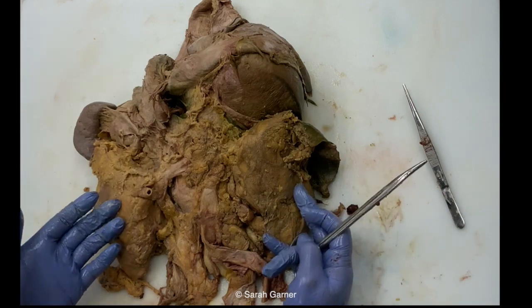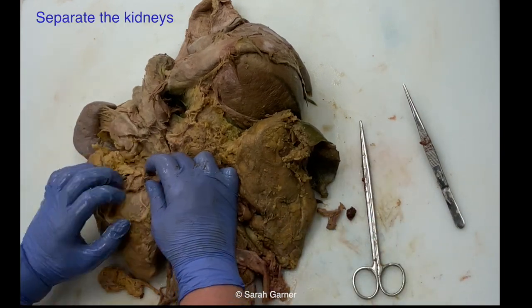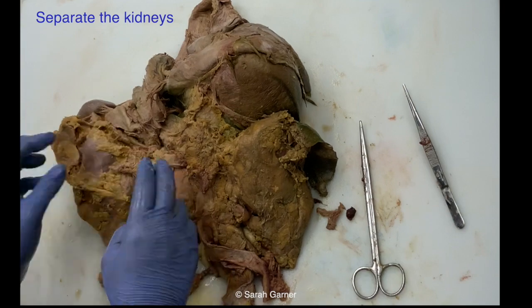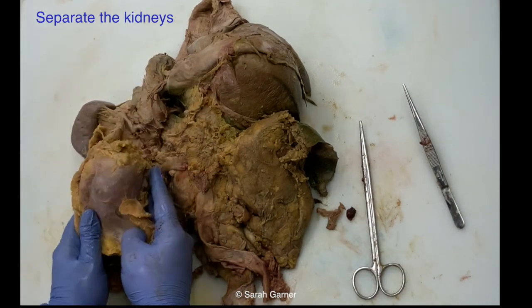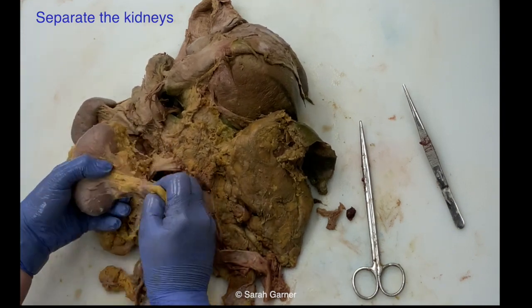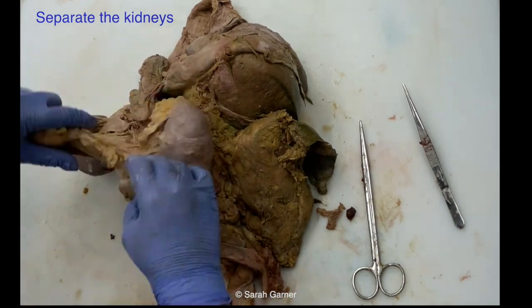So since we're here by the kidneys, I'm going to go ahead and just do the kidneys. With this, I like to take off the fat first before I cut the vessels, because it has something anchored to it. If you cut this first and then you're trying to peel it off, it can get really slippery, especially in a fresh body. So you can just peel off all of this fat. This is your perinephric fat, peeling that off, because you don't want to weigh it with all that fat attached, right?